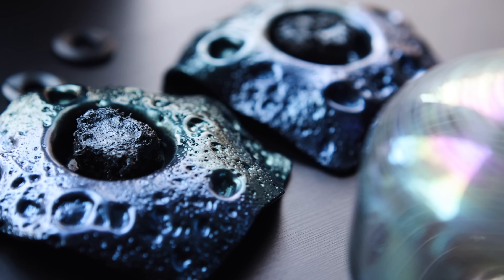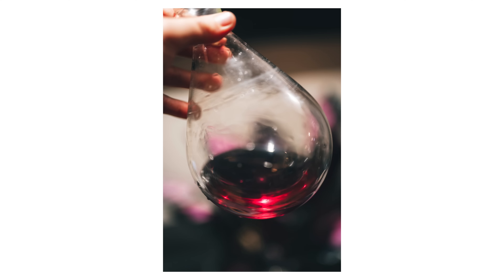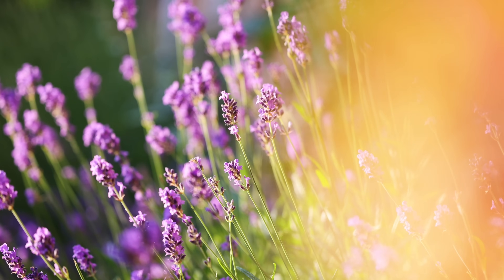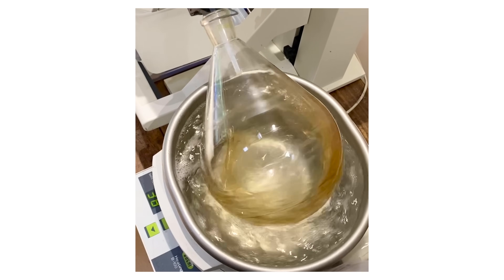I often keep the water produced as a byproduct too, because a bit like the hydrosols I talked about before, this liquid contains some aromas from the original ingredient, so it's a good idea to store it and use it in other preparations. Related to this, I've also made what I call compound honeys in the Rotavap — here I take honey from my own bees, combine it with an aromatic infusion, and then use the Rotavap to concentrate that honey back down to its 18 percent natural water content. We can even layer techniques: I could make a hydrosol of black pepper, add that into honey, then use the Rotavap to reduce that mixture back to 18 percent — and there I've made a compounded black pepper honey.